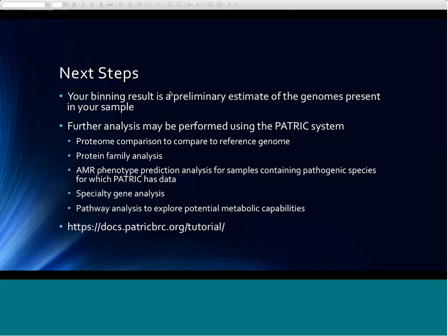Okay. Let's see. Are the reads aligned to a reference in order to be put into different bins? No, we don't. The process takes place first when we assemble the reads into contigs. The contigs are what we're matching to the reference genomes. We don't currently go back and map the original reads onto the references.